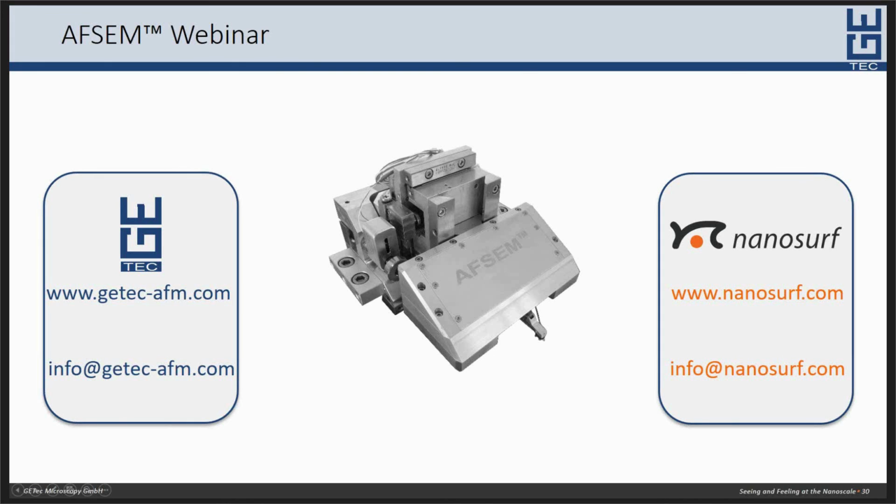Up to now, the SEM and the AFM are two independent systems, so you get the SEM image independently and the AFM image independently. This means that you can use, for example, Gwyddion, which is used as a standard analysis tool for SPM analysis. You can use Gwyddion to do the overlay.